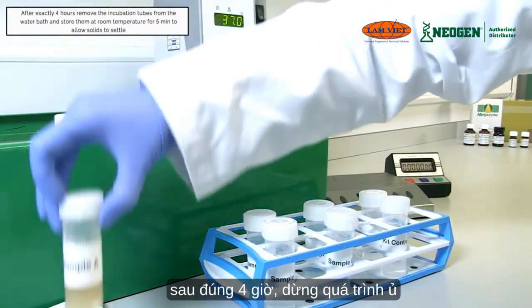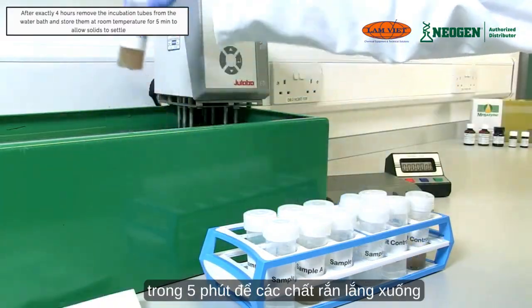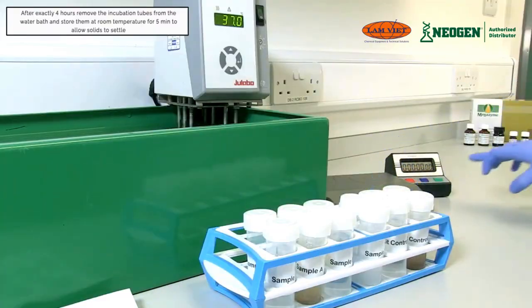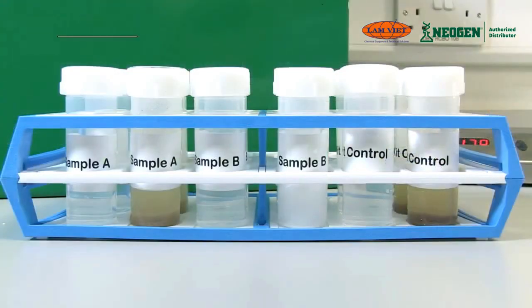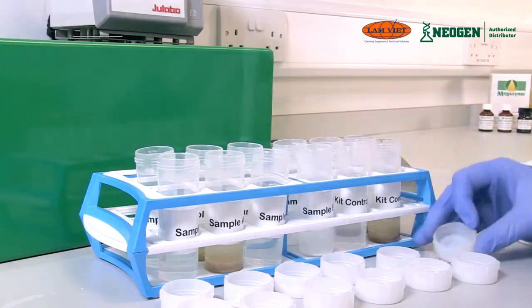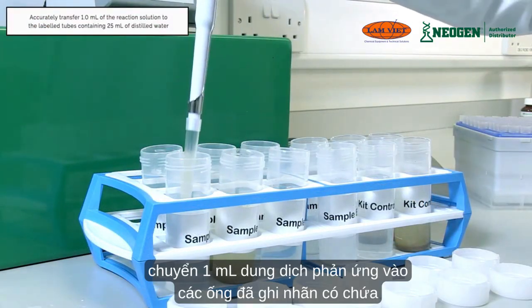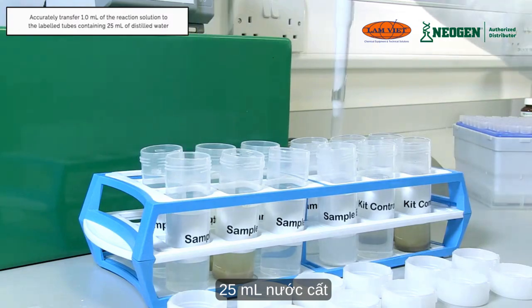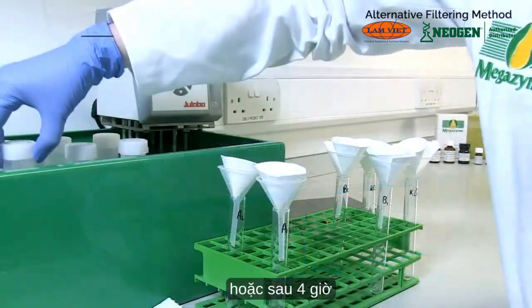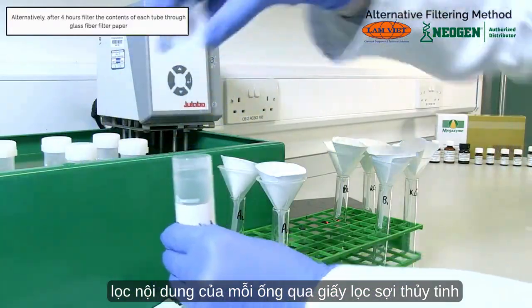After exactly 4 hours, remove the incubation tubes from the water bath and store them at room temperature for 5 minutes to allow solids to settle. Remove the caps from the tubes. Accurately transfer 1 ml of the reaction solution to the labelled tubes containing 25 ml of distilled water. Alternatively, after 4 hours, filter the contents of each tube through glass fibre filter paper.